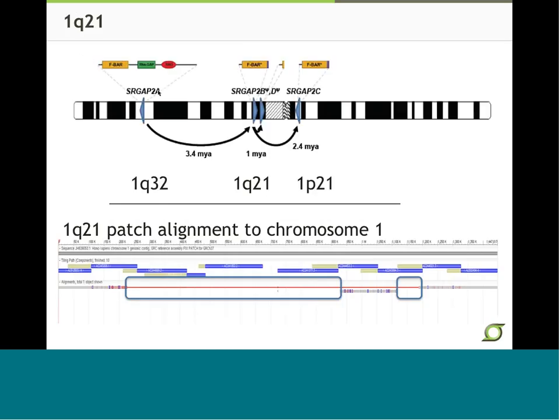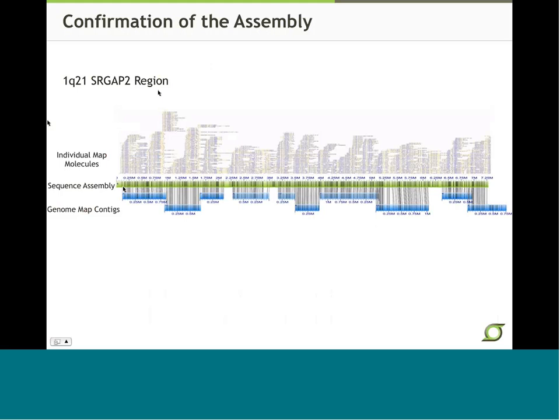Going back to the 1Q21 region where we resequenced the path with CORI-17 clones, I wanted to look at this region aligned to the genome map to confirm our assembly was correct. The total length of the sequence was 7 megabases. In this view, the individual map molecules are shown, the green bar is our sequence assembly, and the blue bars are the genome map contigs. The entire region aligns very well, which really confirms that our assembly of this very duplicated region is assembled correctly.